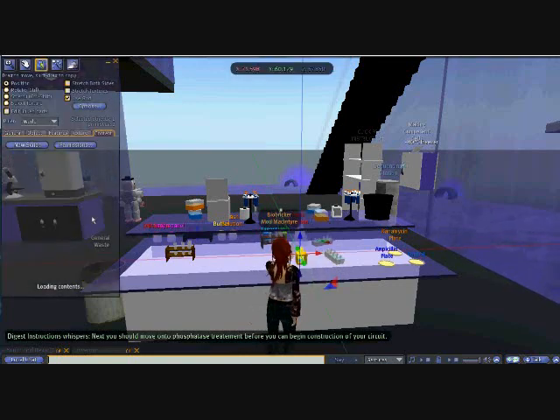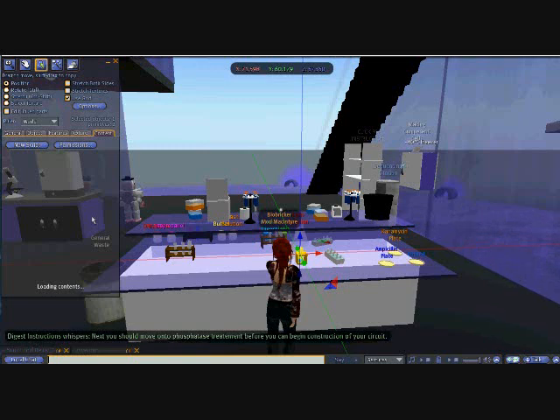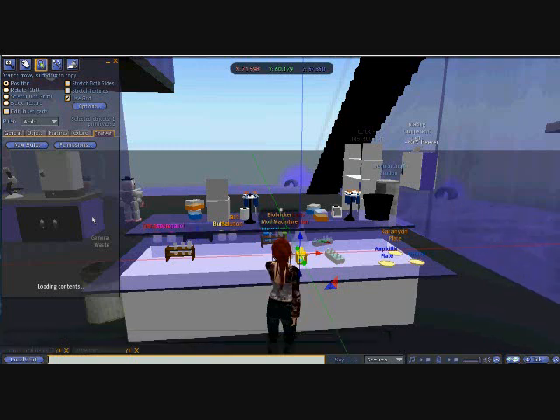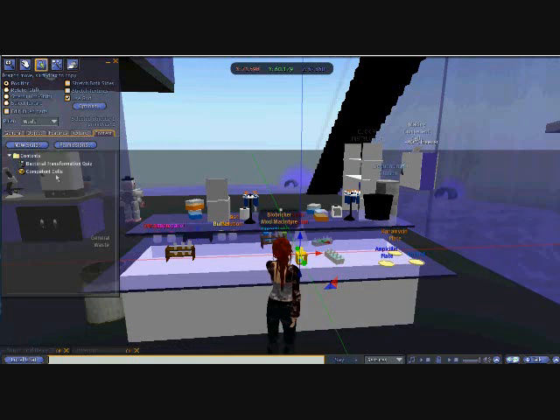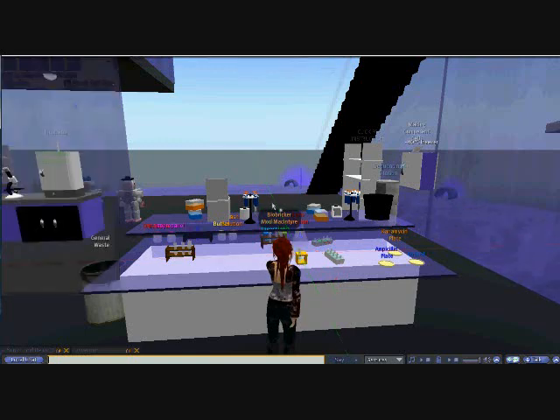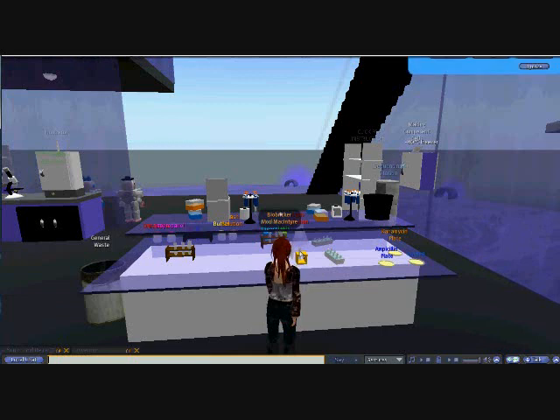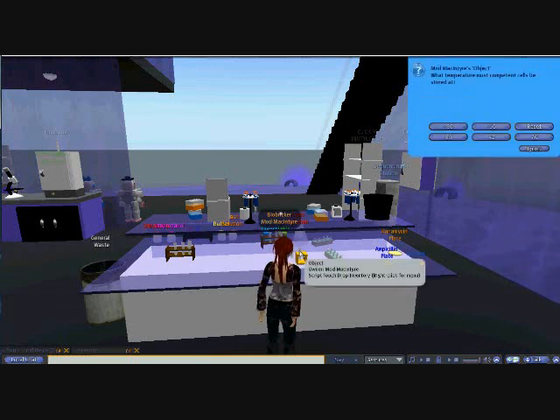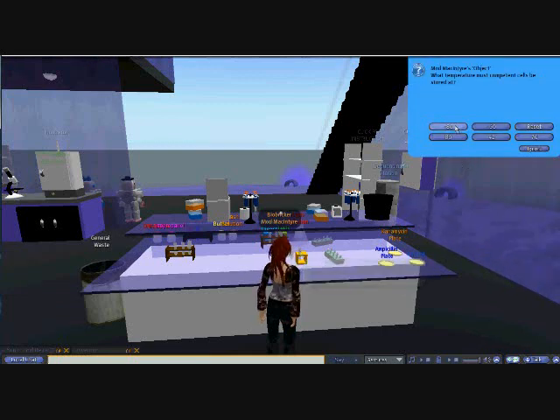So I can add competent cells, which you can see within the inventory if we just wait for it to load. You can see they have been added already, and now if you click the test tube, you'll get a series of questions about the competent cells.